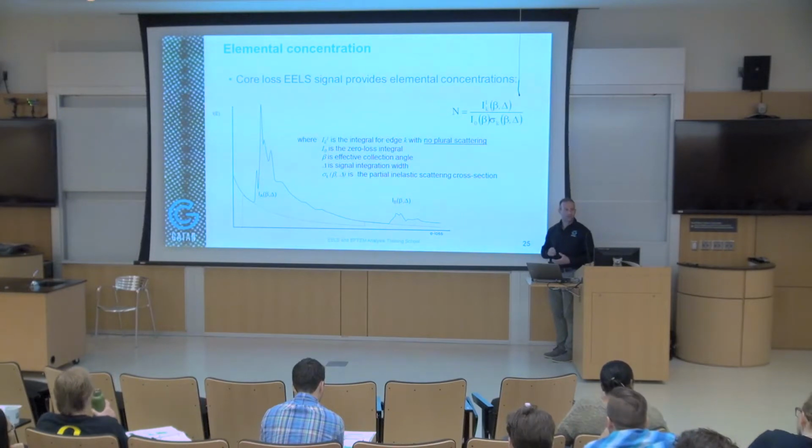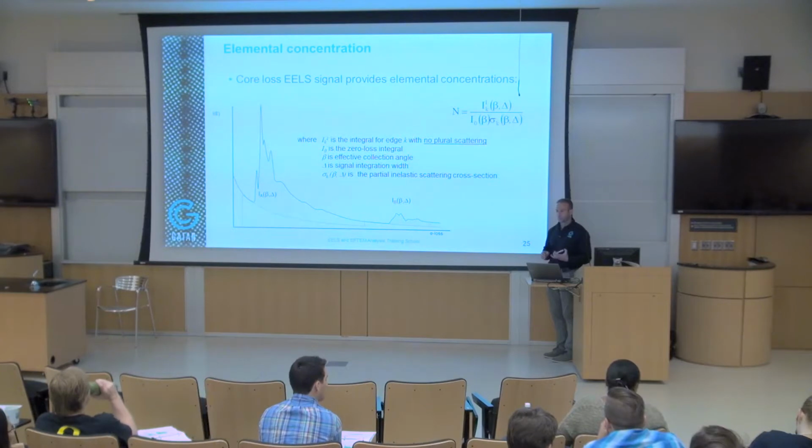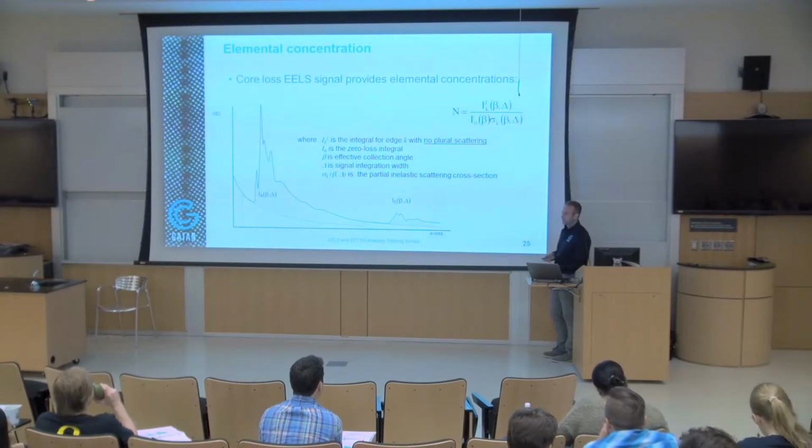Are we going to do any quantification in this course? We will do maybe something when we take some EELS data. I'll show you how the software does the quantification. Okay.